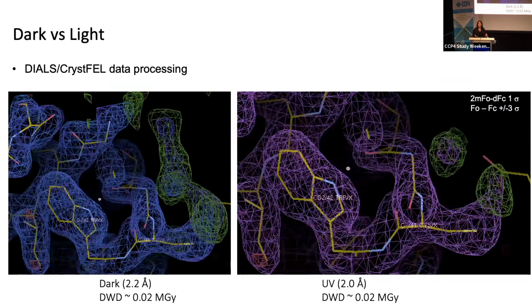So then, okay, I want to collect more data, and my colleagues over at T-Rex very kindly said, if you want to send us some crystals, we can do a different experiment. So we did a different experiment here using low levels of continuous UV illumination, to see if we could drive that damage process to happen more gently over a longer period of time. And again, what we saw in our dark structure, tryptophan, and in our UV exposed structure, tryptophan again.